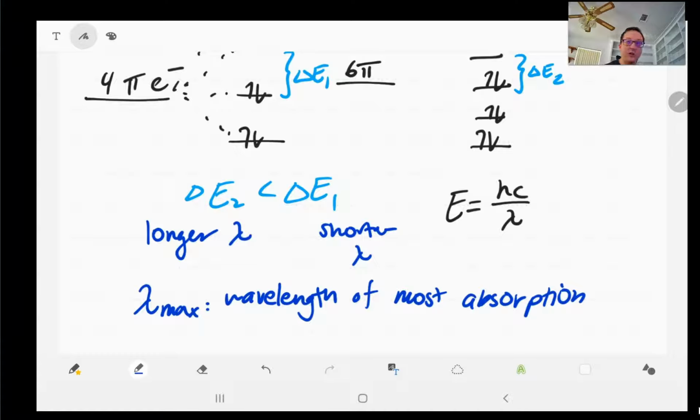So as you're shining your light on your molecule, it will absorb a whole array of light for different orbitals, but the one particular one we're focused on will be lambda max, where it absorbs the most light. And this is something like you've talked about with doing spectrophotometry way back when, in 101, right? You did Beer's law and all that fun stuff.